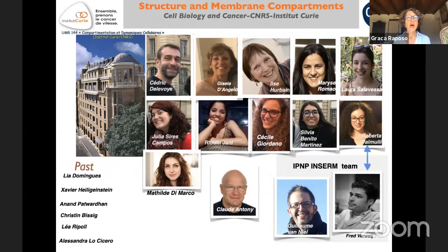So normally I'll just do conventional electron microscopy. And then if we really see something, we say, okay, now it will be interesting to really localize some of the components, because in the meantime, maybe the genes have been sequenced, and we know the components that are mutated in this disease.